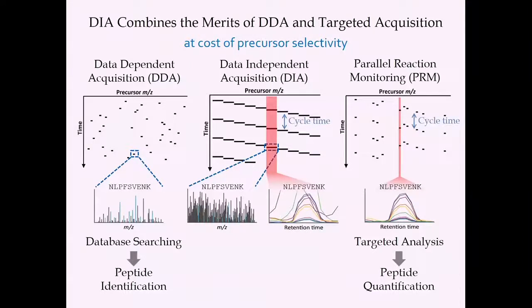So this is basically where we're at. We want to make sure we collect data that's systematic, so that we can reconstruct chromatograms, because we find there's value in integrating a peak area. We also feel there's value in doing the quantitation and detection at the MS2 level. But at the same time, we need to somehow deal with this decrease in selectivity.